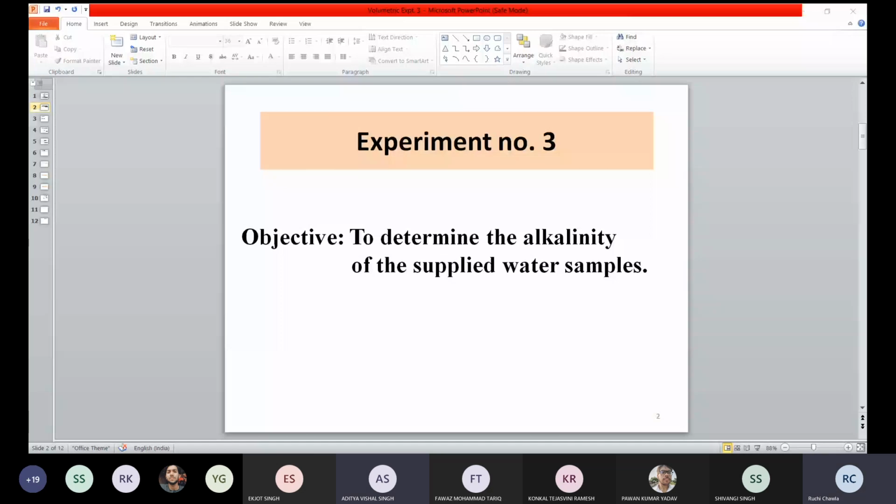It has to be the smaller divisions. Total number of smaller divisions on one side of the rider scale, which comes out to be 50. As you have seen, between two bigger divisions on the scale, there were four smaller divisions. Four smaller divisions. That means 5 parts.